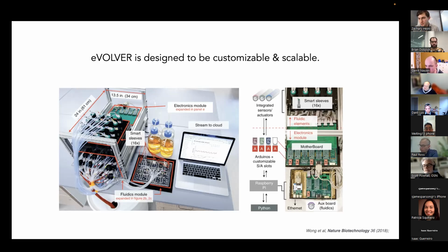So a couple things. One is we've actually hooked up an eVOLVER to an OT2 before. We stuck it inside, and then we had an undergrad program it to interface with all the units for sampling or doing things like that. So that's one thing: it is possible. People have done this before. And I think OT2 is all Python as well, so you can definitely hook that up to the eVOLVER script to include OT2 interactions in your experimental algorithm if you wanted to do that.